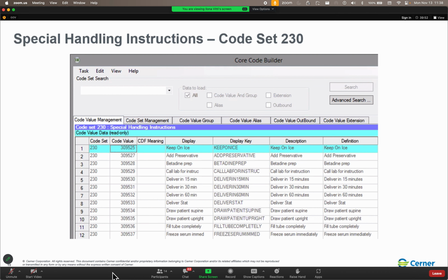Now, folks, once you have built your lab handling instruction, please go ahead and give me that green check mark, because before we go any further, I am going to refresh that code set in the back end using CRM test 6024 and the code set number 43037. So while I'm waiting on your green check marks, let's discuss this whole CRM test business.